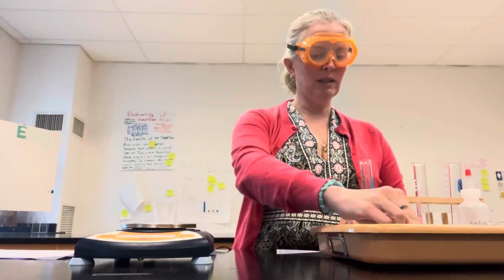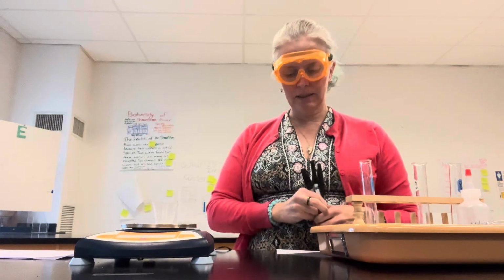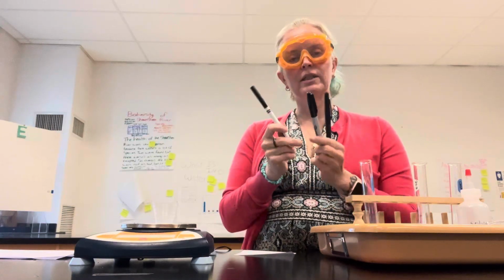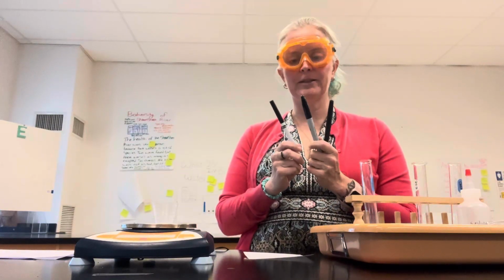So we are going to be separating the components of ink, and we're going to imagine that somebody has forged a pass, written the teacher's name on the pass, and that we have 3 suspects for this forgery. And those 3 suspects each have a black pen similar to the one that is used on the pass. So your task will be to decide which pen was used to sign the pass.